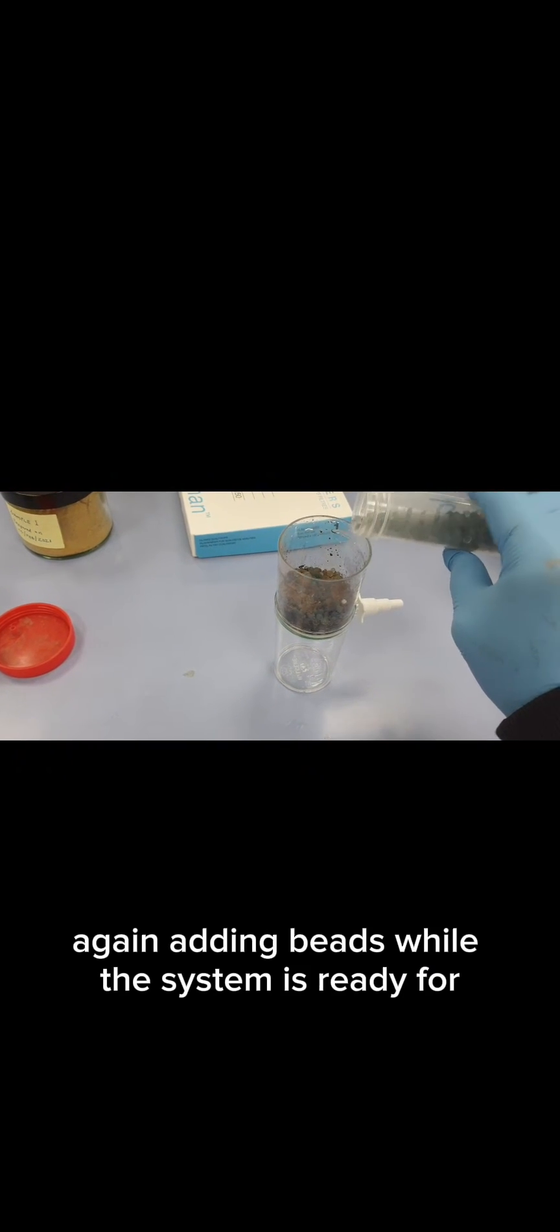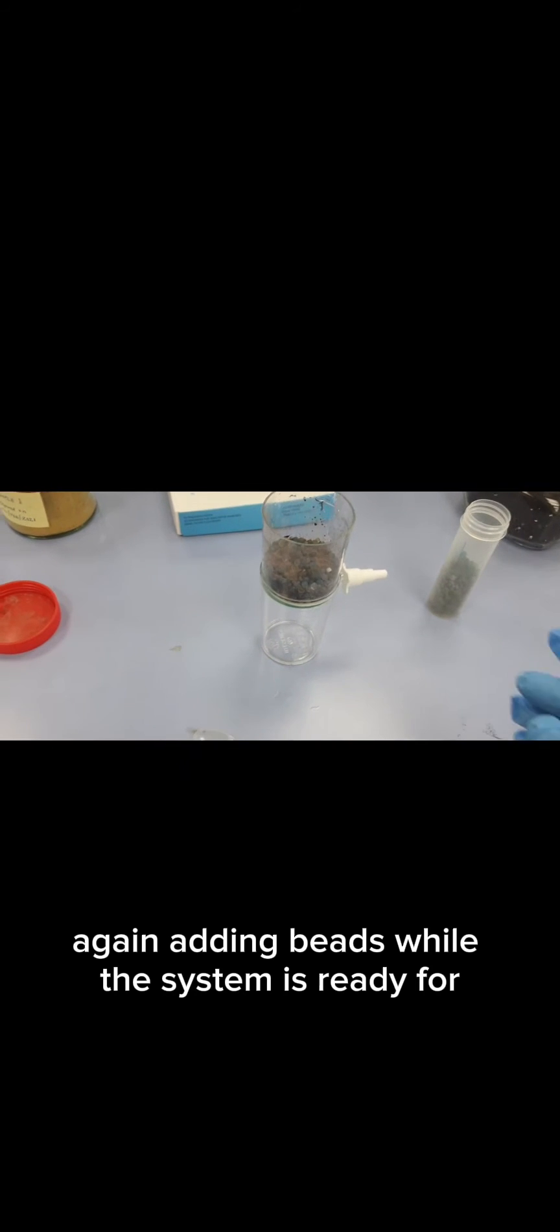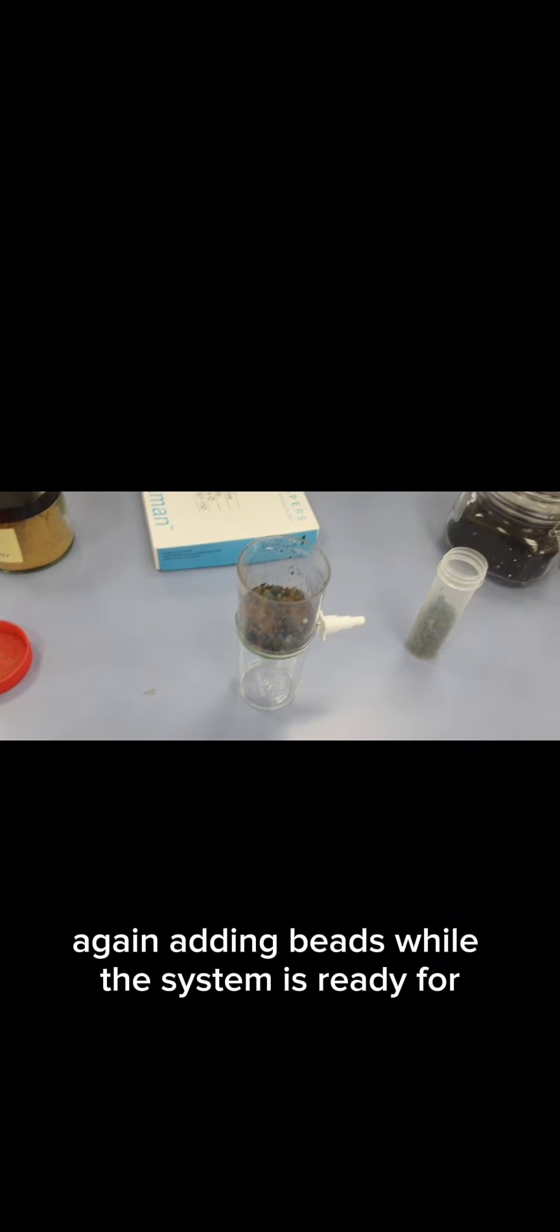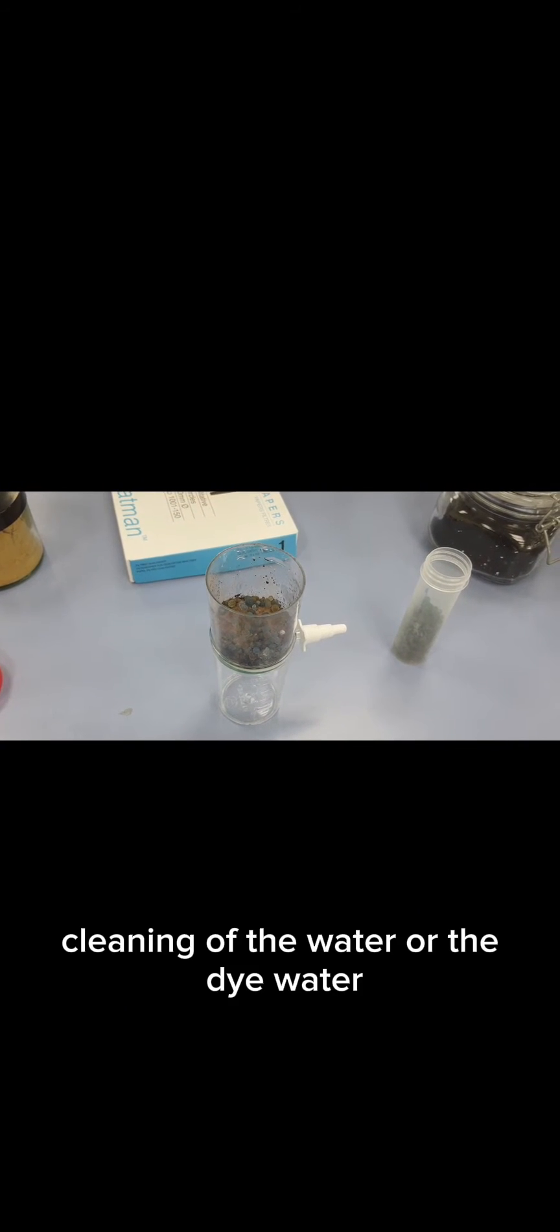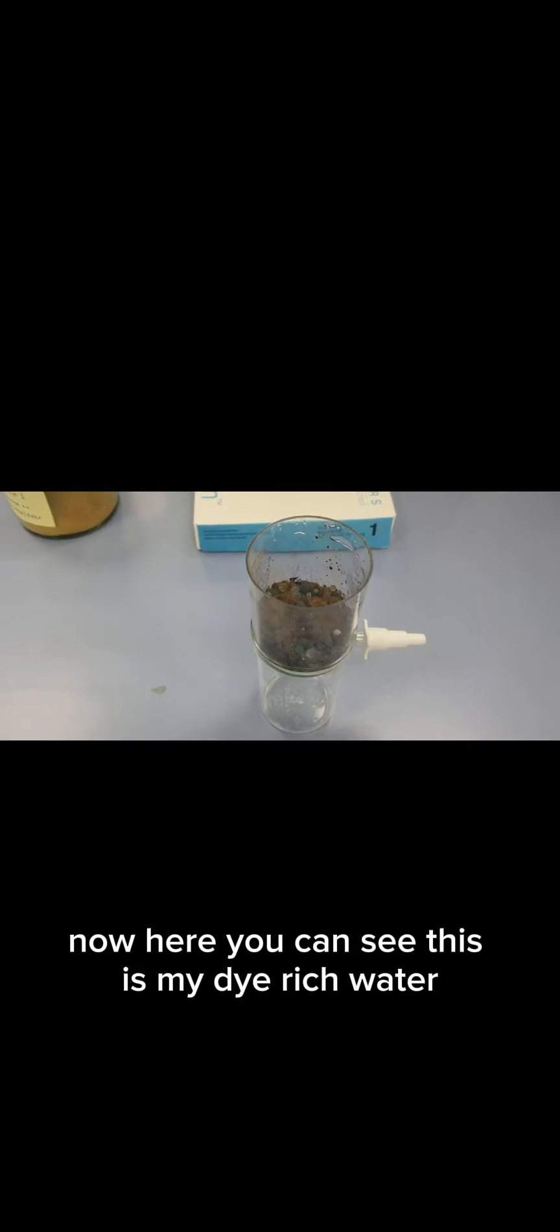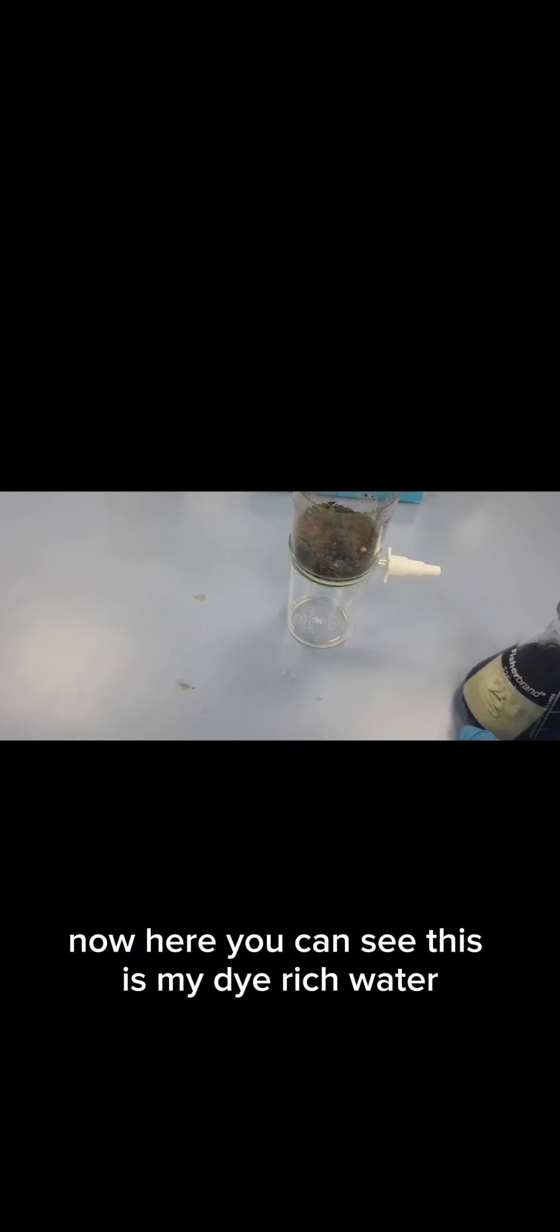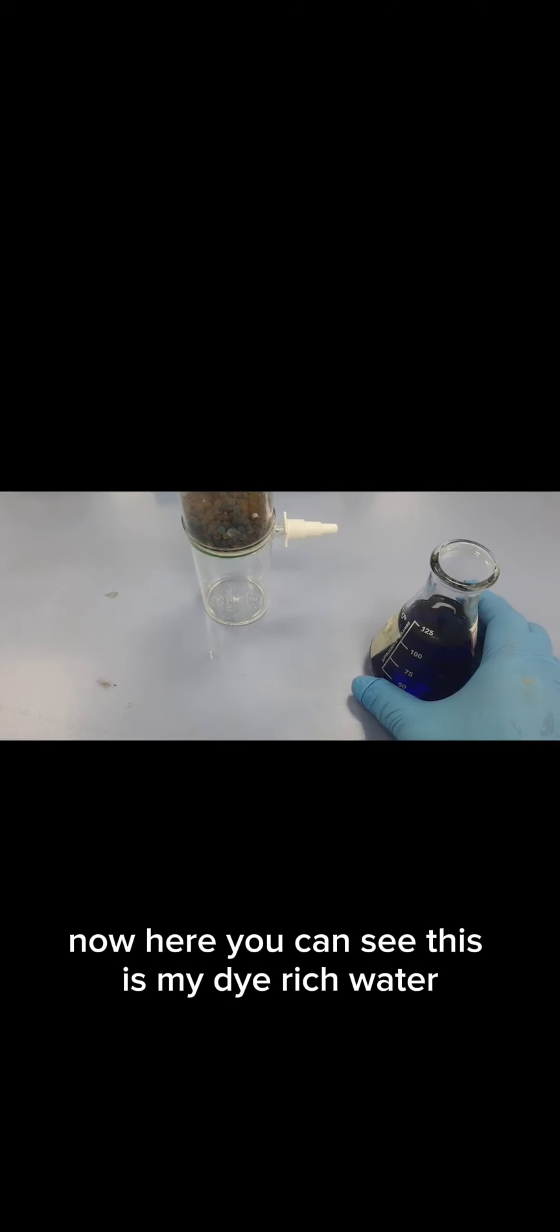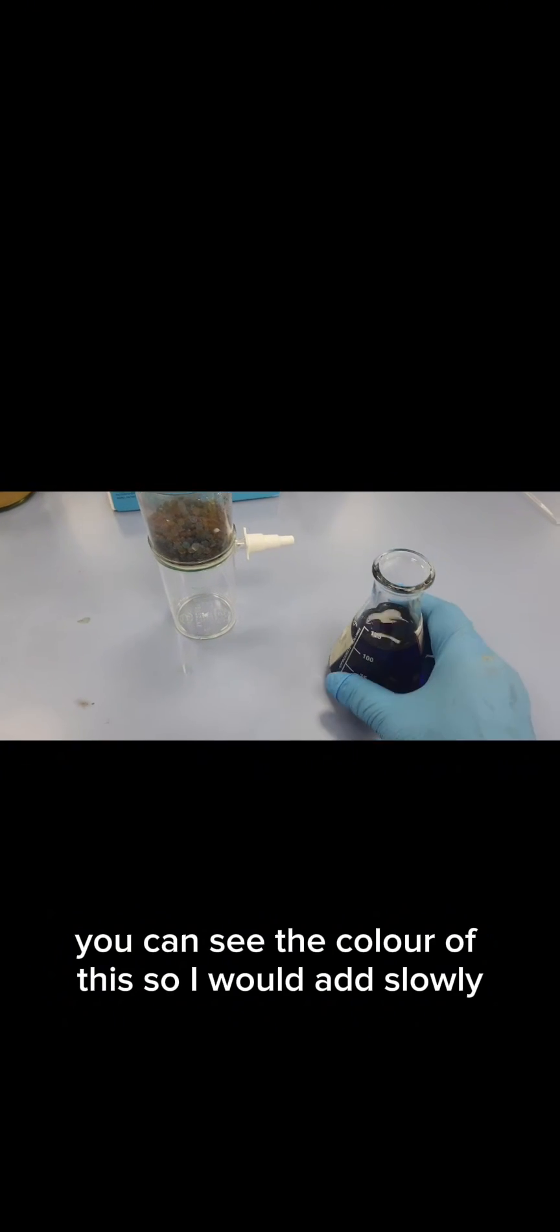Again adding beads. Now the system is ready for cleaning of the water or dye water. Here you can see this is my dye-rich water and you can see the color, so I would add it slowly.